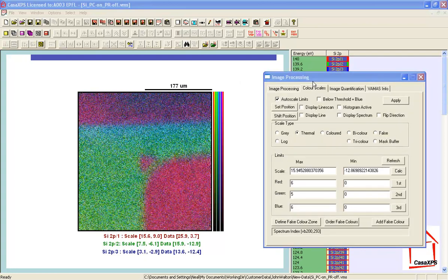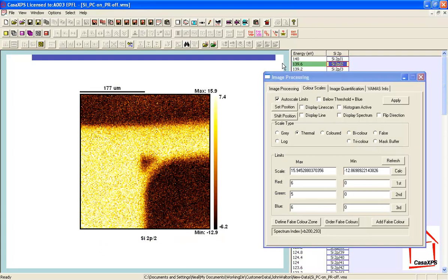It's not always the case that abstract factors yield useful images, but in this case the second abstract factor does yield an image that partitions the information in terms of thick oxide and elemental silicon. I'm going to make use of this image to classify the pixels as the sample changes from mostly elemental to mostly oxide.